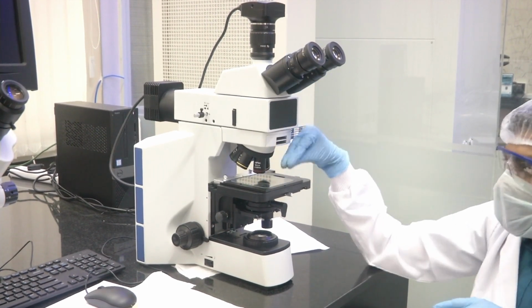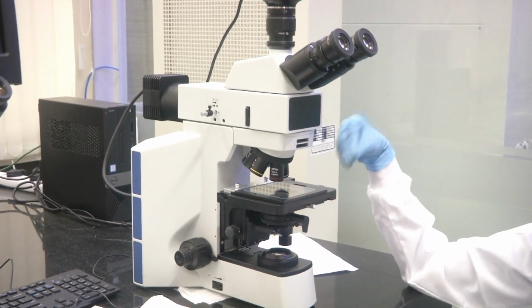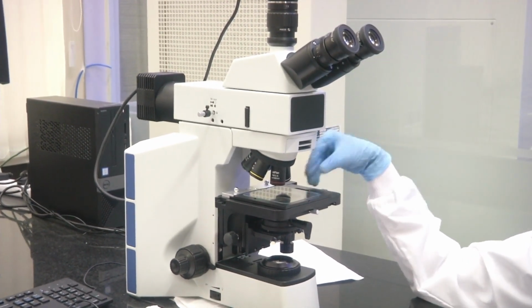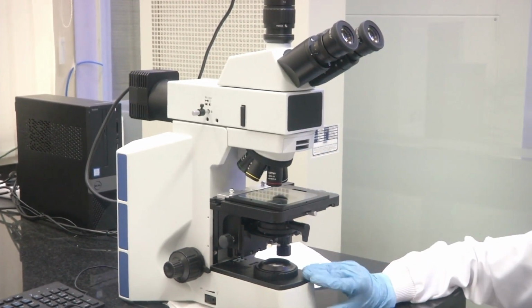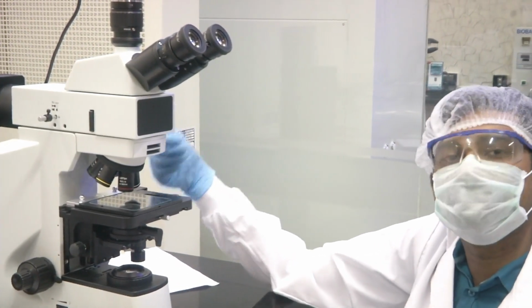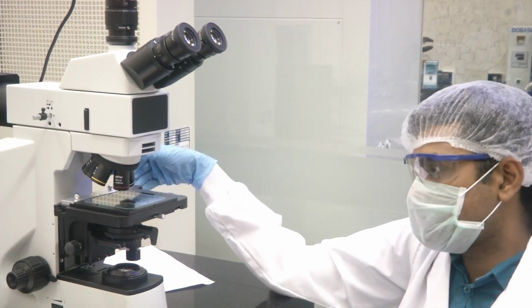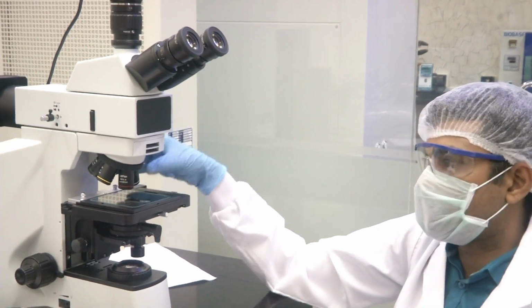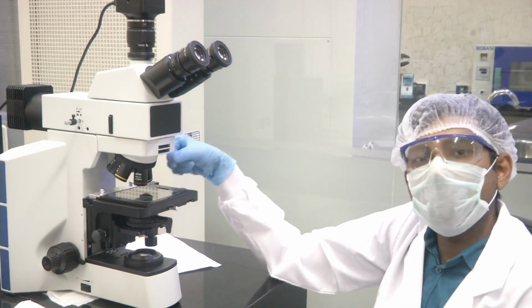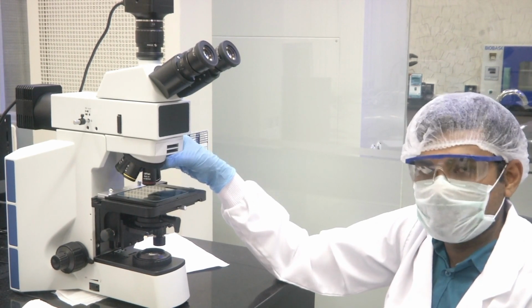So, the light is either transmitted or reflected light. The metallurgical microscope can work in both transmission mode and reflection mode. If we are using bottom illumination, it will work in transmission mode. If we are using top illumination like I showed, it will work in reflection mode, and the reflected or transmitted light from the sample is first captured by the objective.